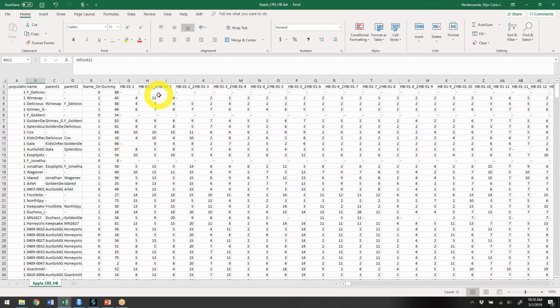When these were SNP data, it was A and B's, and so I could go into Genome Studio and look at the marker call and see if the SNP was clustering well, etc. And otherwise, I could make sure my calls were correct. But with our grouped haploblocks and haplotypes, it's much harder to do so because these numbers don't really mean anything unless you start translating them using that definition file.